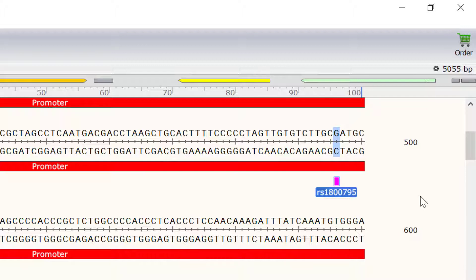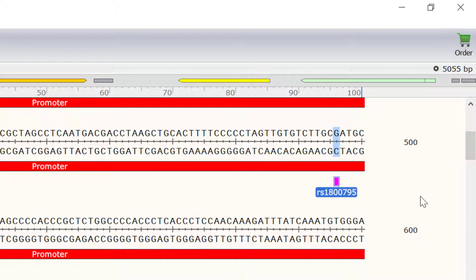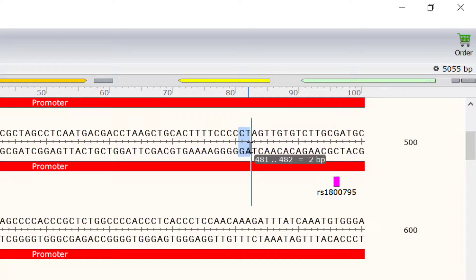The primer design guidelines are usually stated in the kit used for the mutagenesis reaction. For this example, I will be using the QuickChange site-directed mutagenesis kit by Agilent. This kit recommends designing primers between 25 and 45 base pairs long. So, I will select 15 bases either side of my desired mutation.